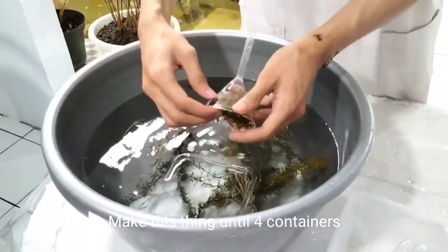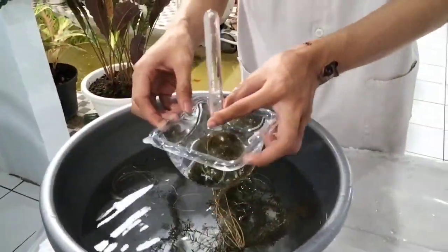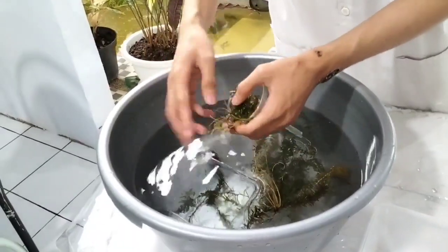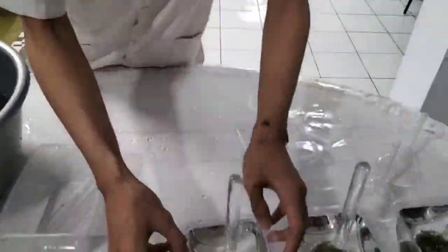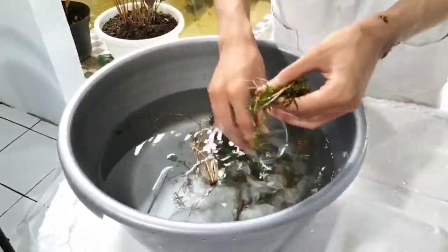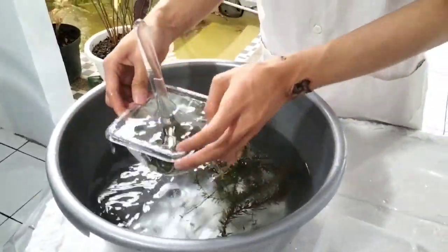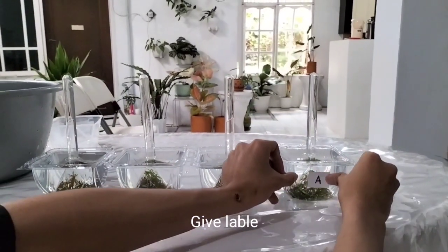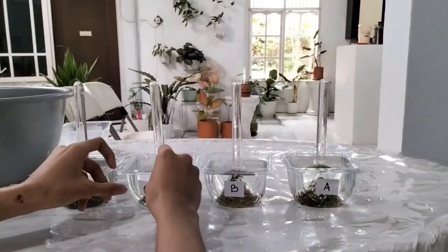Repeat these steps until we have four containers. After that, give a label to each container: A, B, C, and D.